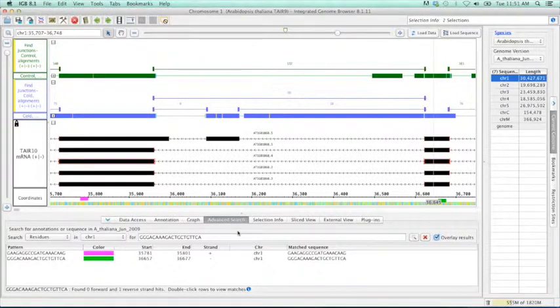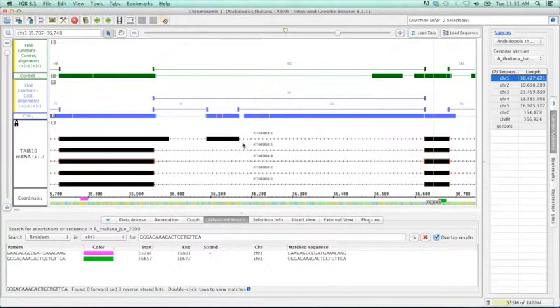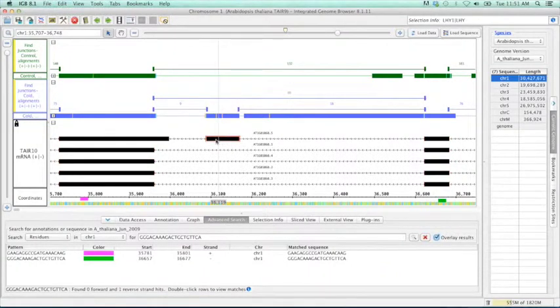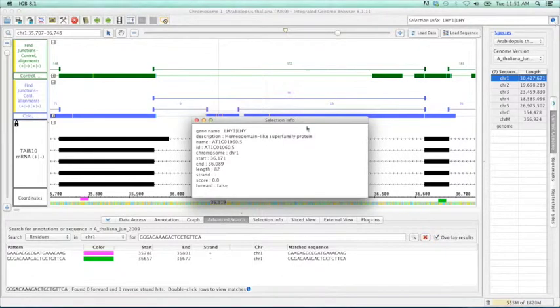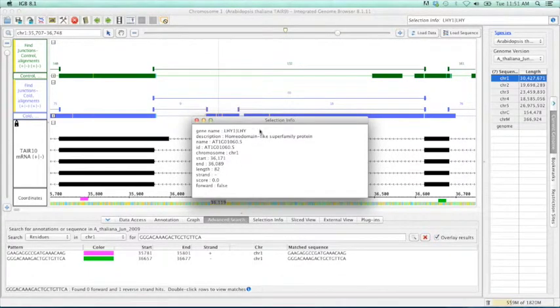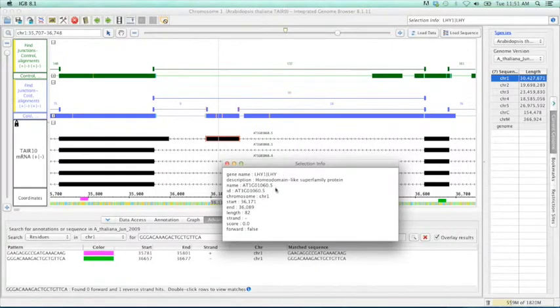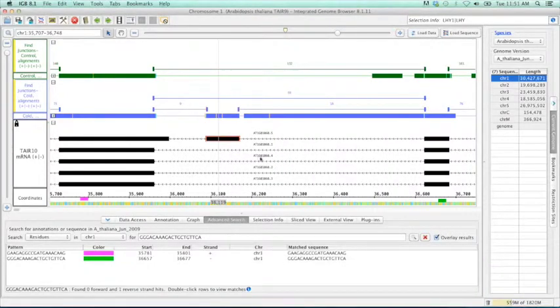We know that our product size, if this exon is excluded, was 236 from Primer3. And if it's included, you can just select it here, and then go up to the I, or information, button here in the top right. And this is 82 base pairs in length, so if the exon is included, the total product length would be 82 plus 236. And I'll let you do that math.